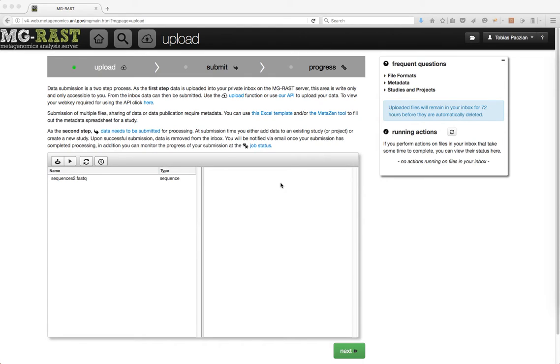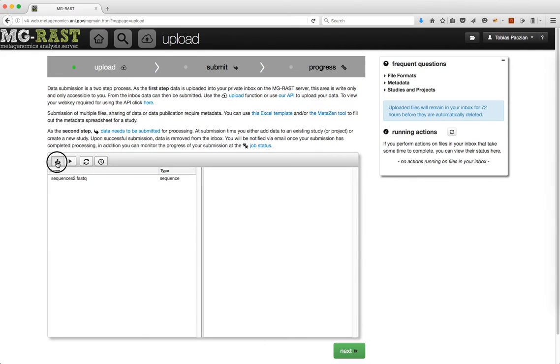Welcome to the MGRast upload tutorial. To upload data to MGRast, go to the Upload page by clicking on the Cloud Upload icon. Click the Upload button to select a file to upload.